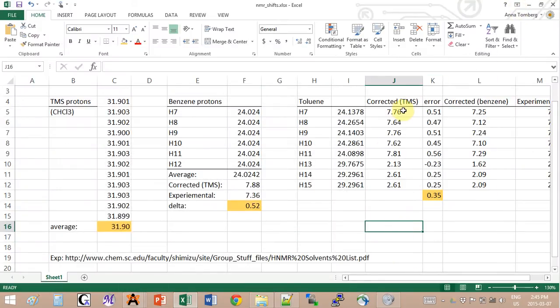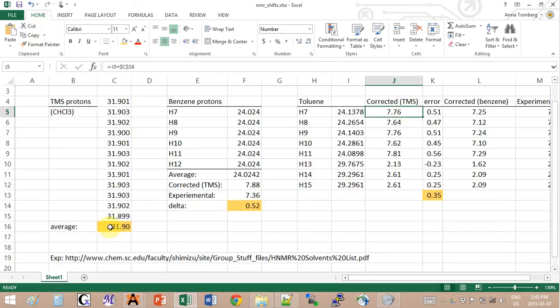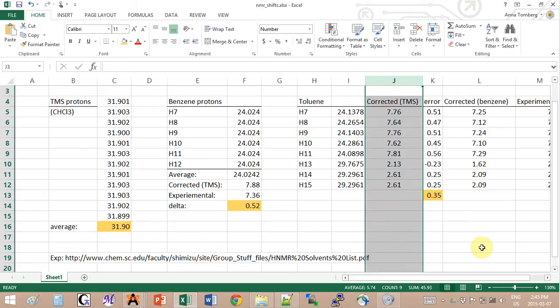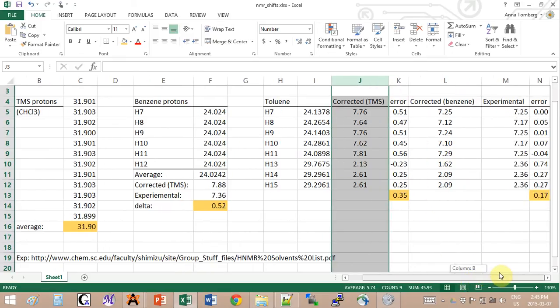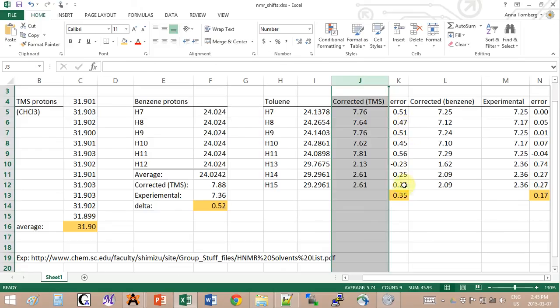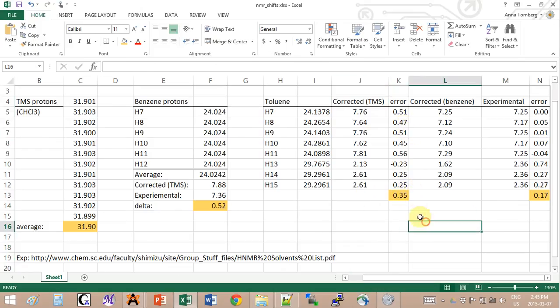We have the protons that are further away from the methyl - like these three, they will have a certain shift compared to those two that will have a different shift. And these three also have a different shift. So now I have three kinds. If we do the same calculation for the shift based on the TMS value, so we will do 31.9 minus whatever we get here.